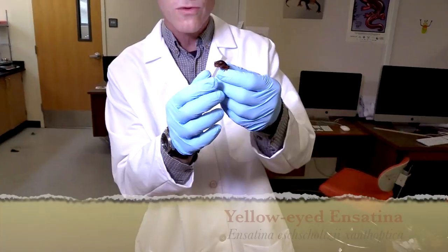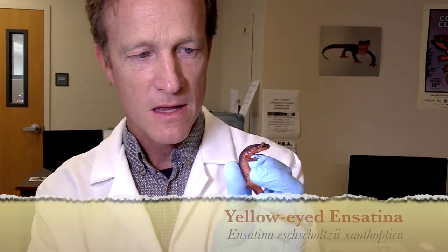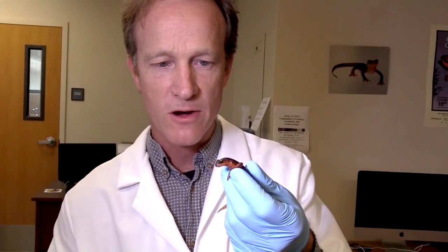I'm going to do it from a salamander called the Ensatina salamander. They're found here in California — these are really interesting animals. They are lungless salamanders. They're quite big; they get a little bigger than this, and there's lots of color variation across the different subspecies here in California.